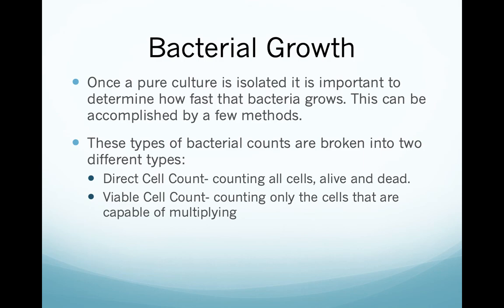So once you've grown up your bacteria, you've got a pure culture of it. You want to count how many bacteria you have. You want to know what you started with. You want to know what you've got now to see how fast it grows and things like that, to figure out what the generation time is, to figure out how fast this organism is growing in your patient, to say, oh, I've got a while to worry about trying to figure out what this is, or oh, I need to get on this quite quickly. This person's going to die very fast from this.